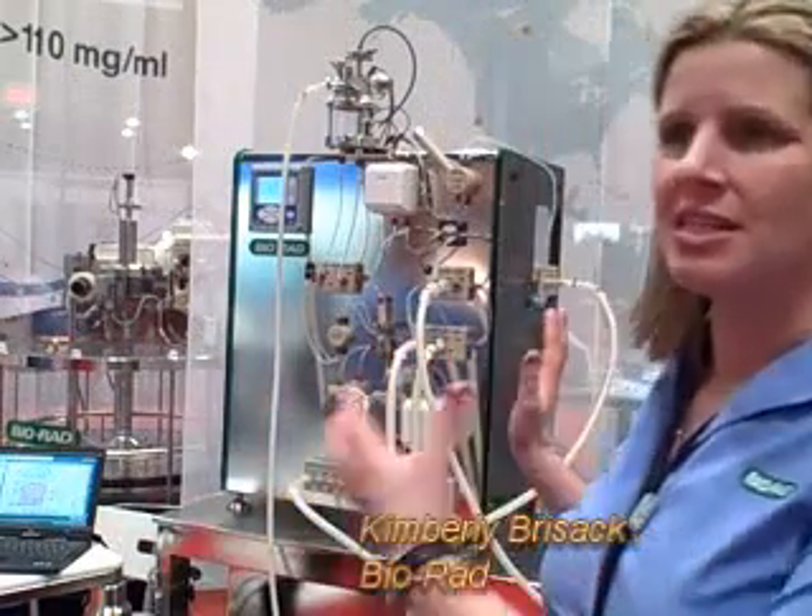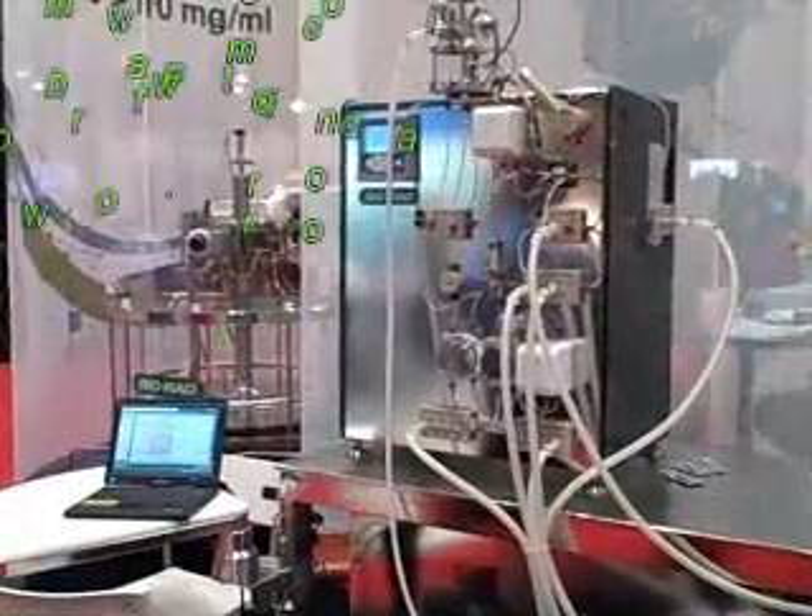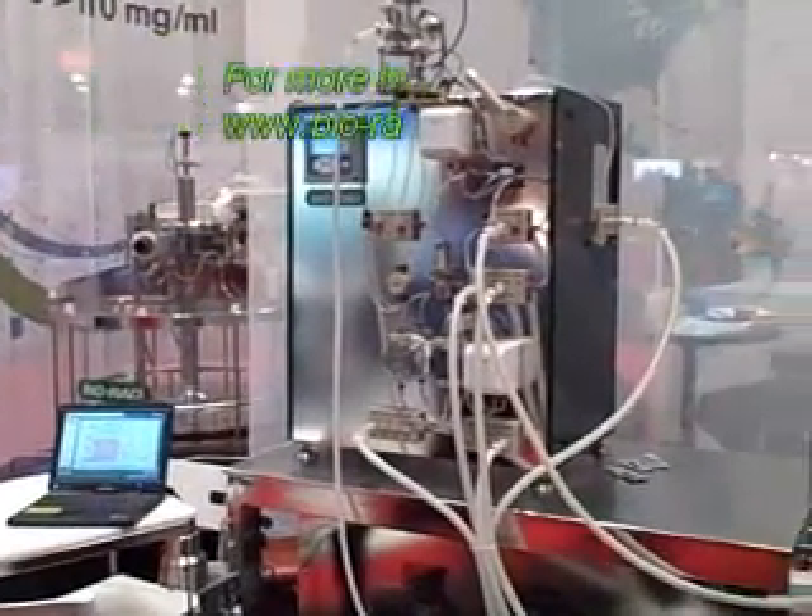The nice thing about having the small skid is that it's a very small footprint. We know that processing space is always at a premium, so having a very small footprint with a very fast flow rate is ideal. Awesome, thank you.